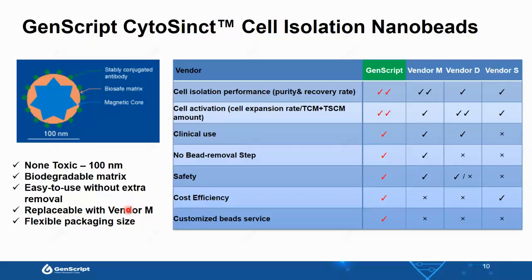Thanks, Dr. Yu. The next question: you say that the size of your isolation beads is 100 nm, but on Miltenyi's website, it says that their beads are only 50 nm. Does it mean that your beads are bigger compared to Miltenyi's?